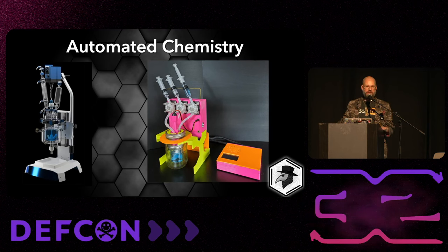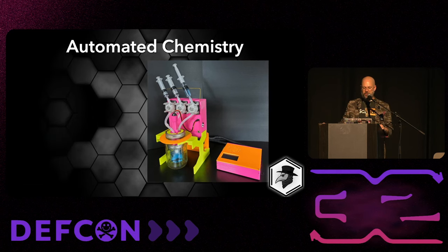The outer jar has a circulating fluid, and that circulating fluid maintains the temperature. And on the top, you have peristaltic pumps, which pull from those syringes to inject the reagents. And then there's a little box next to it, and that is the brain that executes all of these commands. So let's see if we can take a look at all the bits and pieces of this.